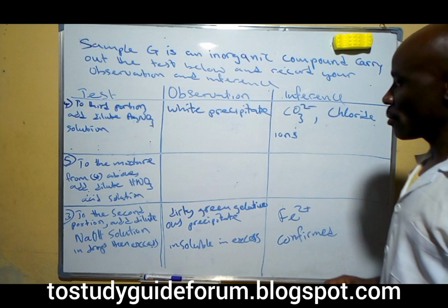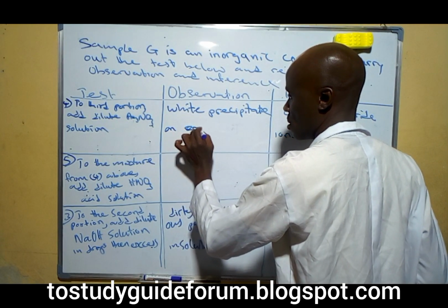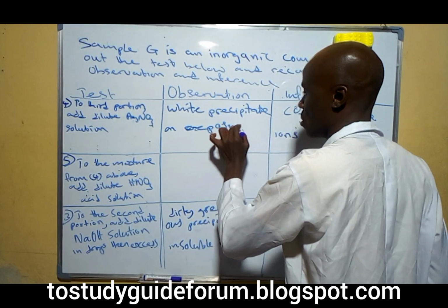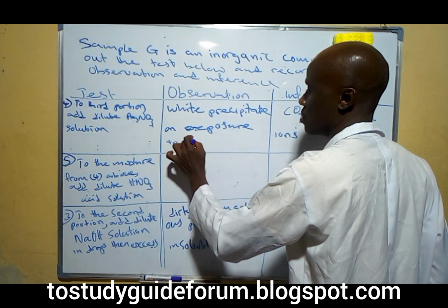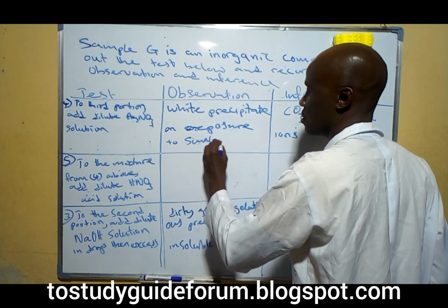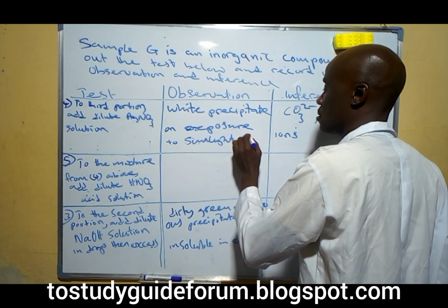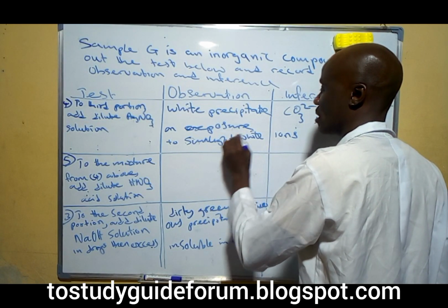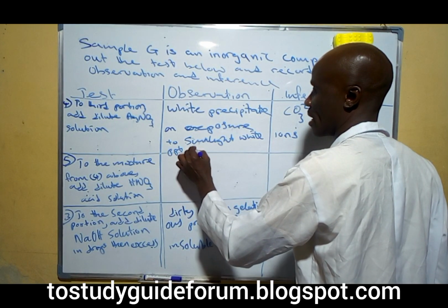But there's something that happened here. On exposure to sunlight, the white precipitate darkens a little.